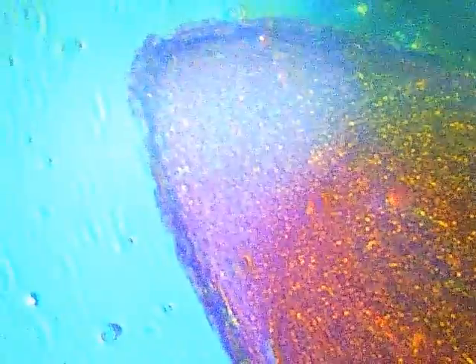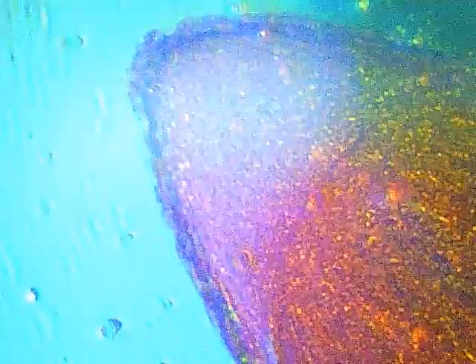Okay, so what are we looking at here? A root cap. And so this part of the root, you can see there's a clear line that comes up around here. Look up here. These are where our new cells are growing. This is what detects—what do the cells do? They detect which way is up and which way is down.